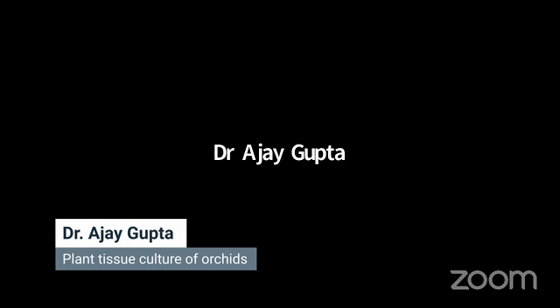But the thing is that it is a high altitude plant, and it grows at a low temperature. So if we want to produce this plant in the plains where the temperature is high, we have to maintain it in a tissue culture lab where an artificial climate is created. So for this, plants are grown in a tissue culture lab, and this is not a small one. It is a commercial tissue culture lab.